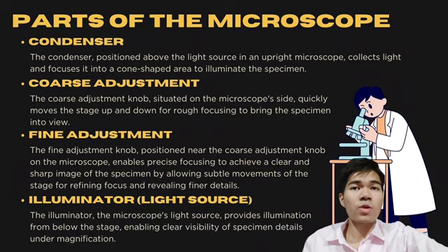So moving on, we have the coarse adjustment. So the function of the coarse adjustment is to bring the stage up and down for the rough focusing to bring the specimen into view.